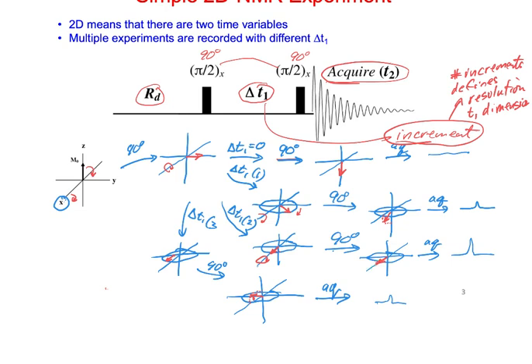The second one or the fourth one? Well, you'll have sharper peaks because of that. Because as you said, the perfect one that's on the x-axis is not going to be affected. Right. Everything off of that axis is going to be rotated. Yeah. So it's a lot sharper. Yeah. So maybe it's not as simple as I was thinking.